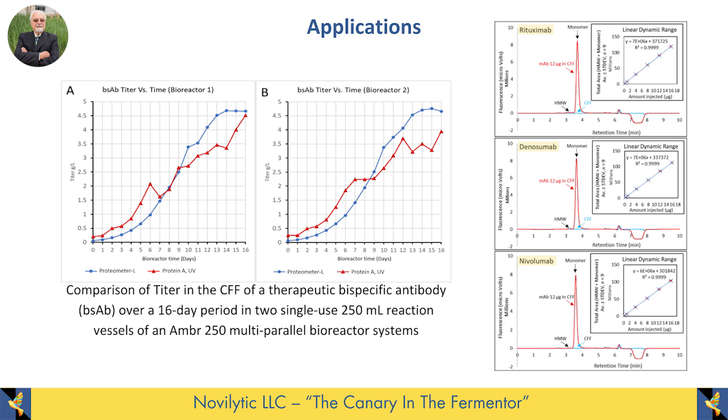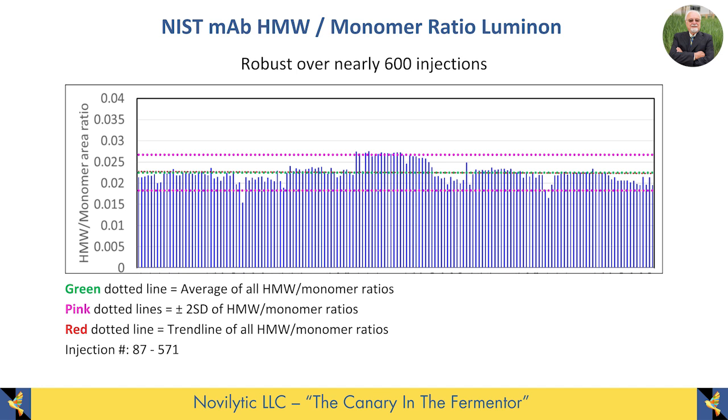So the nice thing about that then is we designed the assay so that you can turn around and assay large numbers of different antibodies with the same test system. So if you go off and run a large number of tests, this is, for example, 600 runs, and that would be almost the entire 2 weeks of a production run.